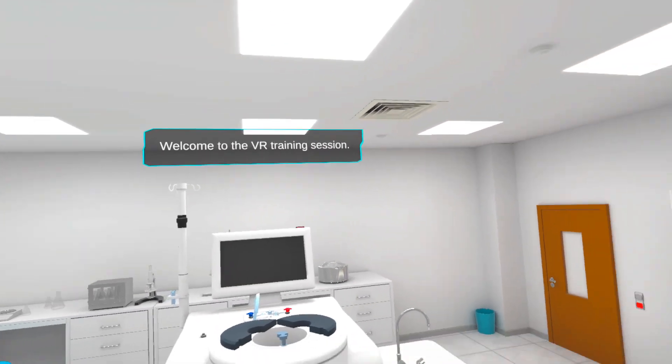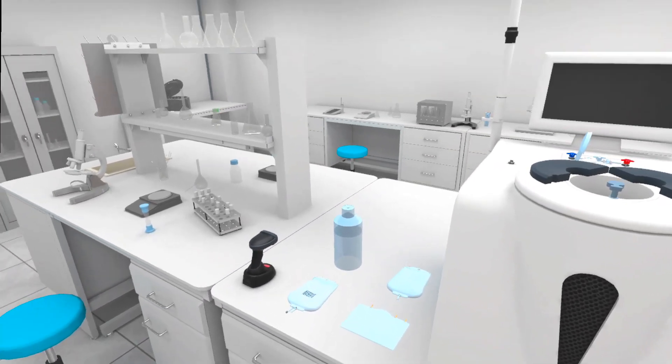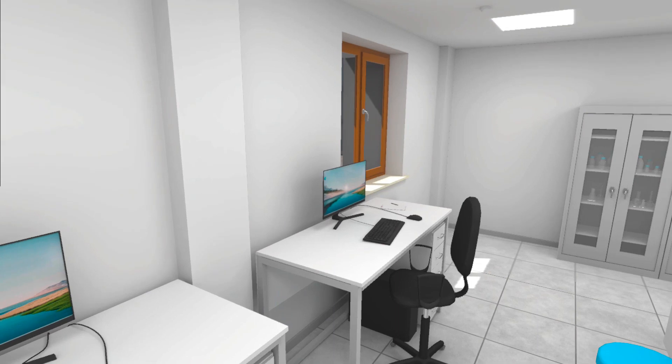Welcome to the VR training session. Here you will learn how to operate CPAC's CPRO Cell Processor. It is a multifunctional device composed of hardware, protocol software, and dedicated kit.